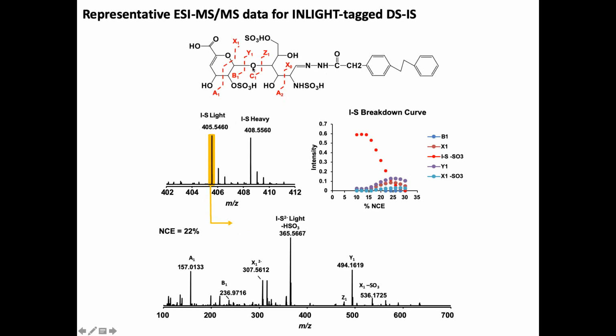This just shows you how changing the energy of fragmenting these ions can really impact the amount of information that you get, so you have to do a lot of optimization before you dial into what works best. You can see that between 20 and 25 gives you an apex of a lot of different fragments from this species. And this is the intact, it's basically going down.